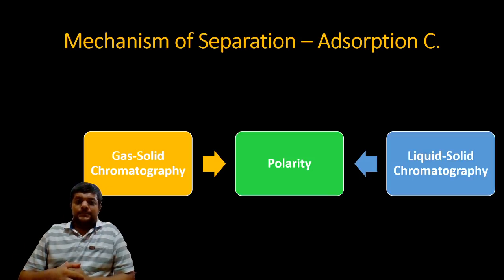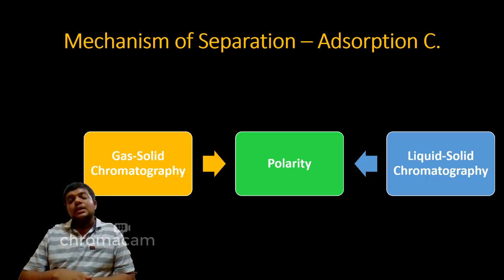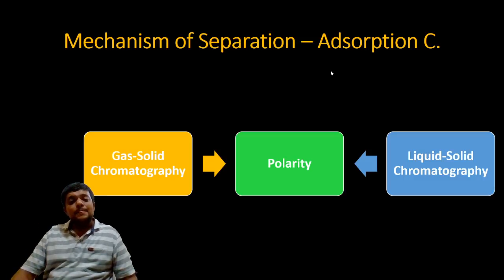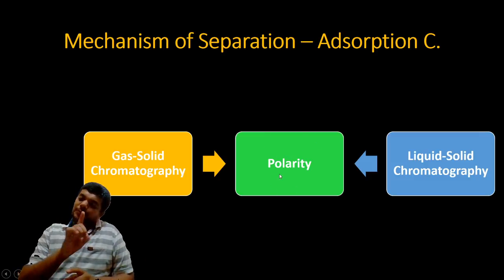Over here, mind very well, the polarity is very much important, a key factor in separation. As of now, remember this as a base, because when we will be learning HPLC over here in the liquid solid category and GC over here in the gas solid chromatography technique, I'll make you understand the concept of polarity.